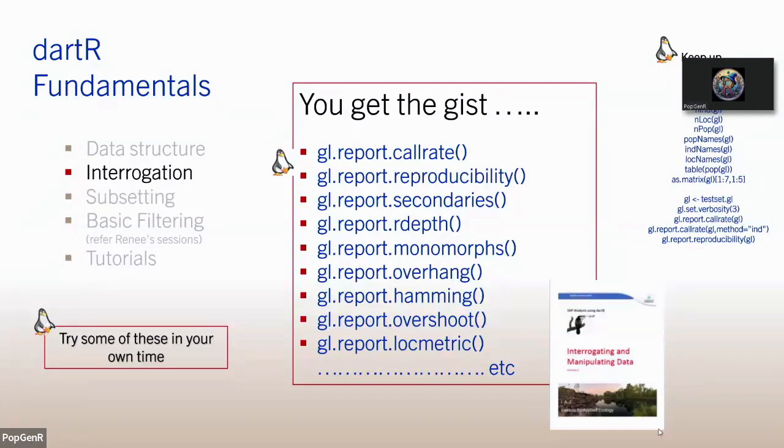So when DArT trim the sequences, they trim the adapters off. Every now and again, the true sequence will match the adapter. And so it'll trim off a bit of the end of the sequence tag, which might happen to have a SNP in it. So you end up with an invariant sequence tag that's been scored for a SNP. And so that matters if you're going to concatenate your sequences for a phylogeny, for example, because you're just adding in an invariant bit of sequence in there unnecessarily. So you might want to report on the overhang.